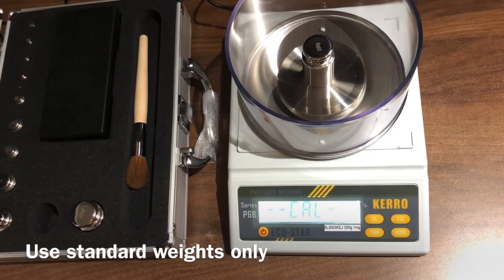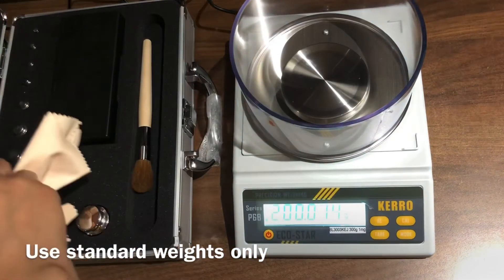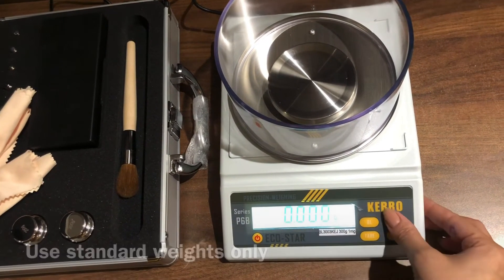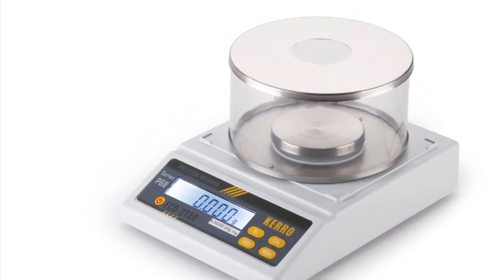Once done, the screen will show 200. The calibration is complete. You can recheck the accuracy again by putting the same weight over the pan.